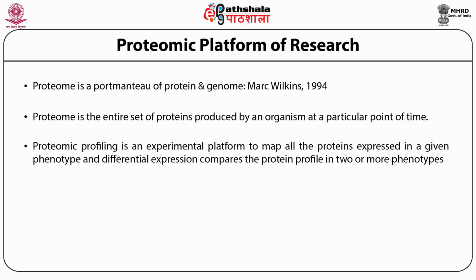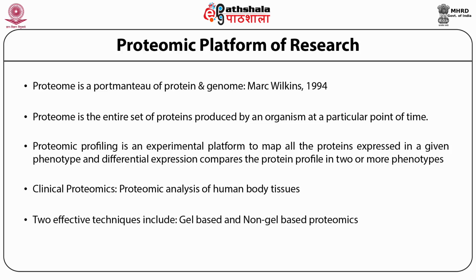And when these become relevant to the human body and health, it is termed clinical proteomics. Clinical proteomics comprises protein profiling, which could be done either by gel-based proteomics or non-gel based proteomics. However, both these techniques require a very disciplined approach to sample preparation, which is key to a successful proteomic experiment. Some of the ways and means of effective sample processing for gel-based proteomics will be presented here.